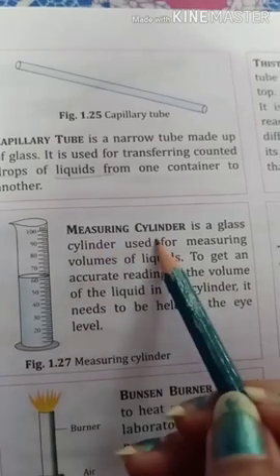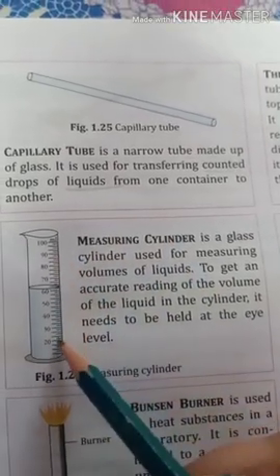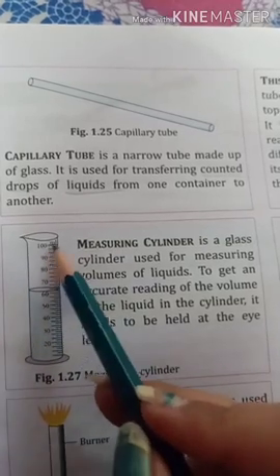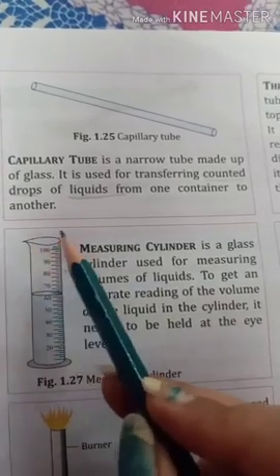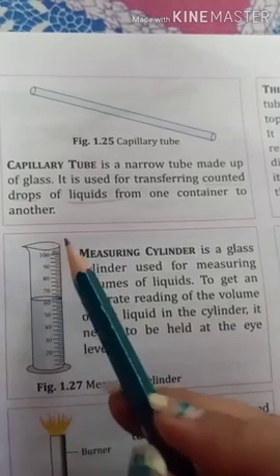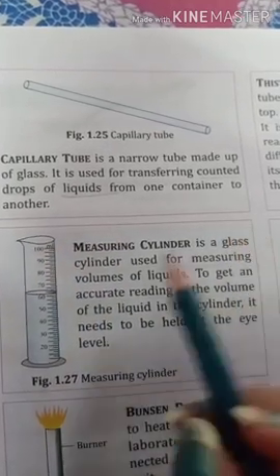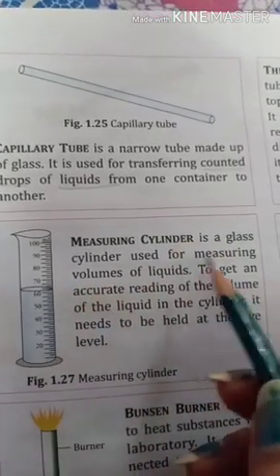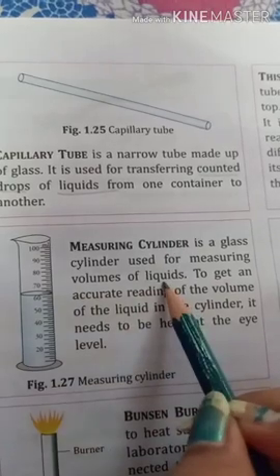Next is measuring cylinder. This is a measuring cylinder with numbering 20, 30, 40 up to 100 ml. So the capacity of this measuring cylinder is 100 ml. This cylinder is made up of glass or maybe plastic, and these cylinders are used to measure volumes of liquids.